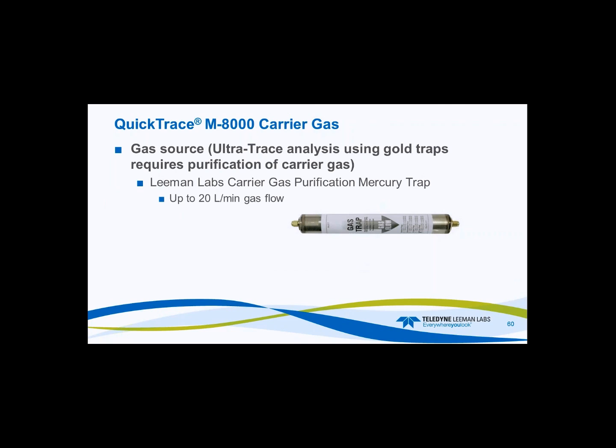Now, some quick tips on method setup for ultratrace analysis. I'm going to have a following webinar, which I'm going to lead into with a little teaser here, that will be more about method development, how you actually do things on the instrument. This is to get you familiar with the software and some basic functions here.